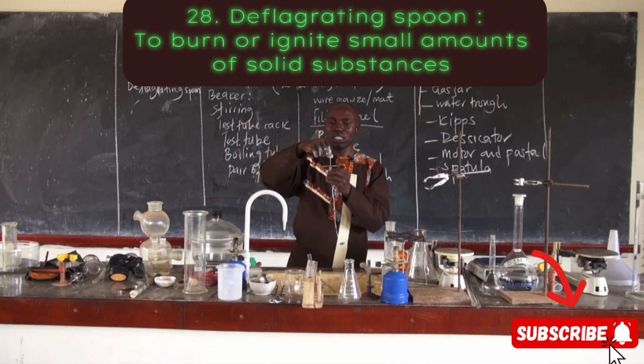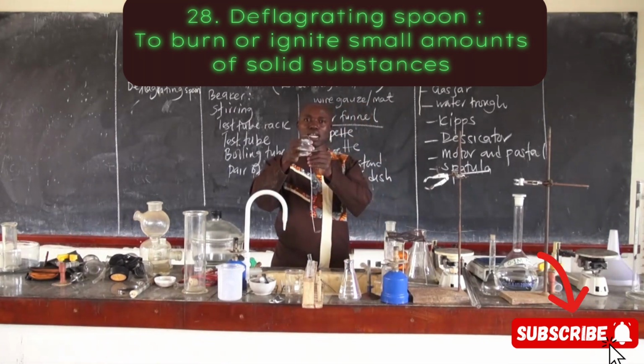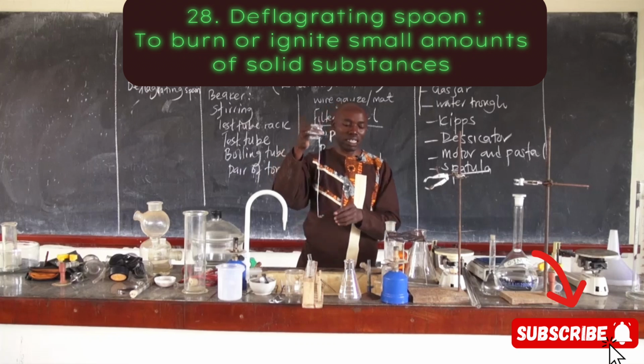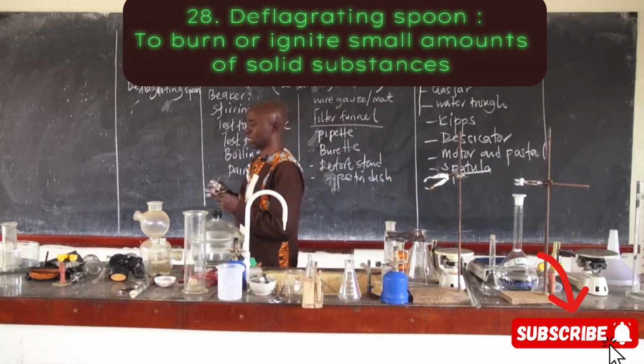There are special substances which I might have an interest in for the experiment, like if I'm burning sodium metal and I wanted to burn it in excess air, I would like to find out what happens during burning sodium in excess air.